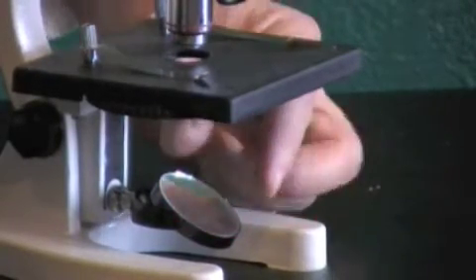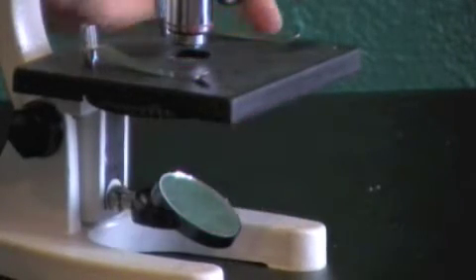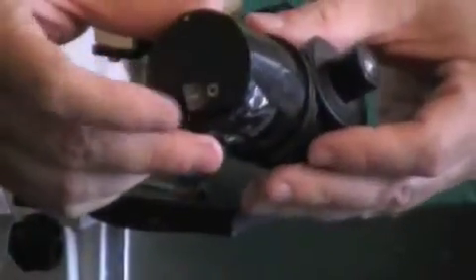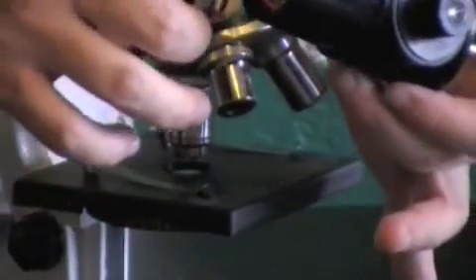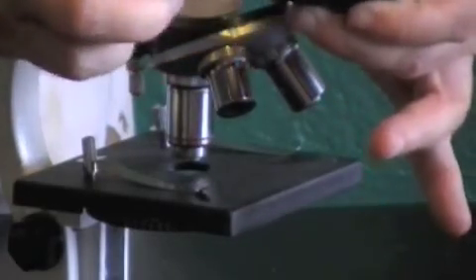Now, this works great, but you may not want to use the mirror. Most of your microscopes will come with a light source for them. Now this light source should have a switch over here that turns it on. Inside it, if you check, is a battery case. So if it's working, don't mess with it. But if it doesn't work, take out your battery case, replace the batteries, and it should work fine then.